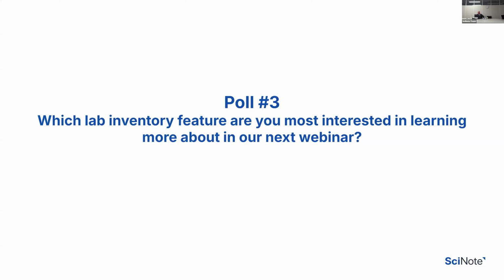Item relationships. Okay, I'm gonna slowly close the poll. Okay, the last question just came in. And check the chat, because I know somebody, okay. Oh, actually, we have a lot of questions here. Let's see.